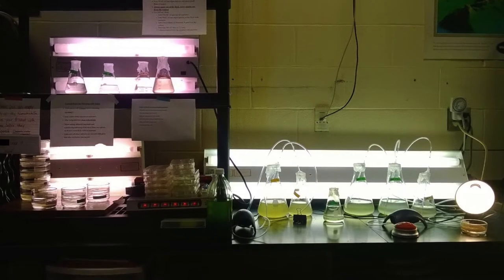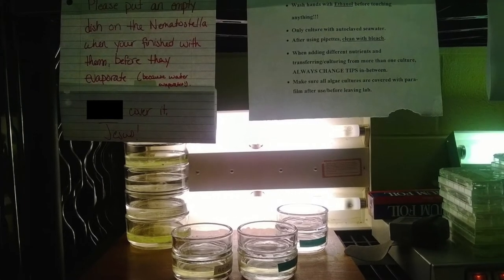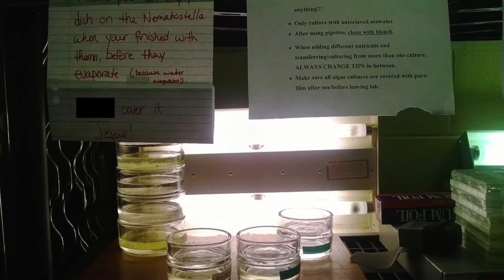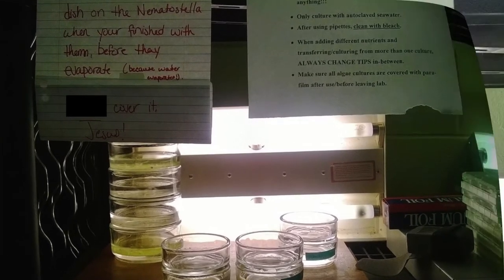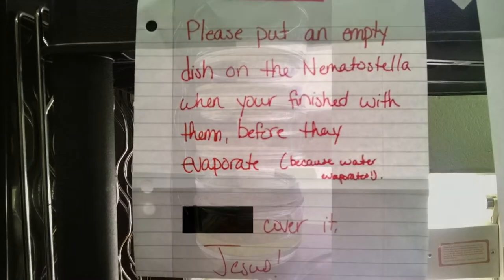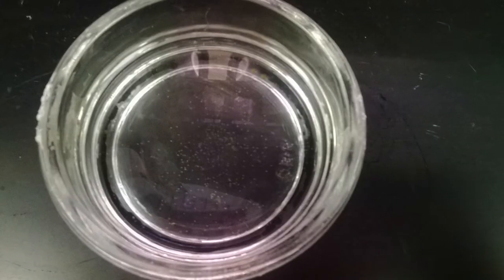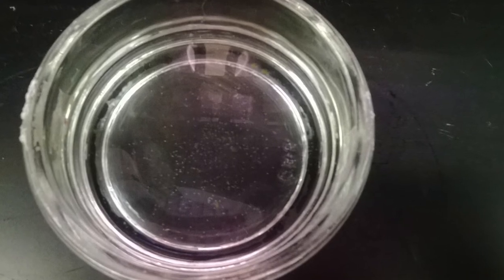The nematostella in our lab are kept next to the algae, in their own little area kept from 18 to 21 degrees Celsius, or average room temperature, equipped with a friendly note to our fellow student scientists. Our organisms are kept in a glass culture dish — the larger organisms in the larger dishes, and the just-laid eggs and juveniles in the smaller dishes.